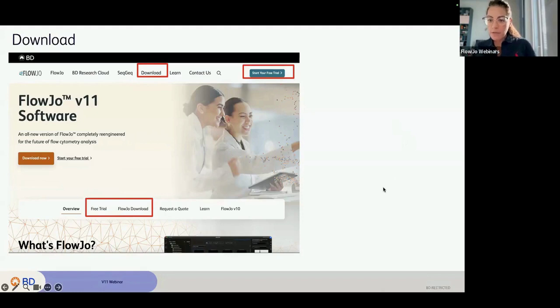And then there is another question: if I want to continue with version 11, one has to buy a new dongle? I'm not sure I understood the question. If I want to continue with version 11, maybe you're referring to version 10. The subscriptions cover both version 10 and version 11, while dongles only allow access to version 10. So I hope I have answered your question, but if I haven't, please feel free to clarify that.